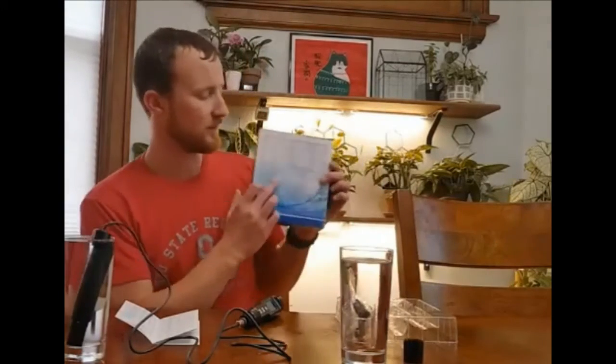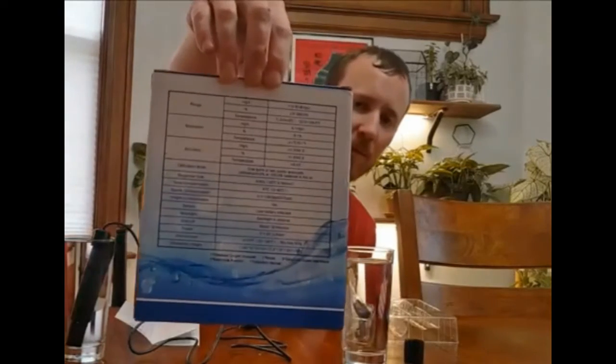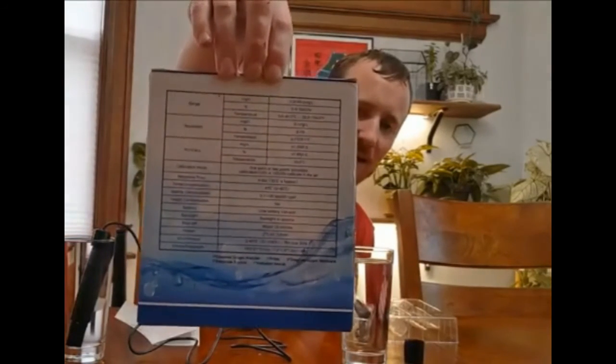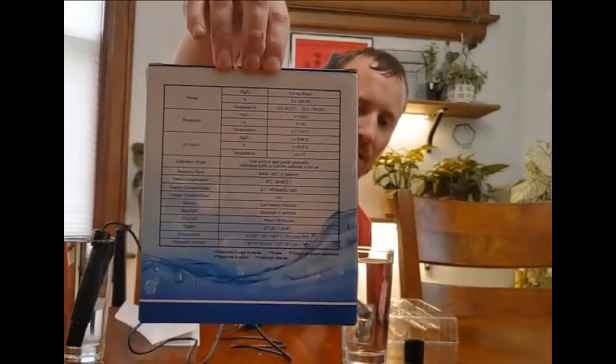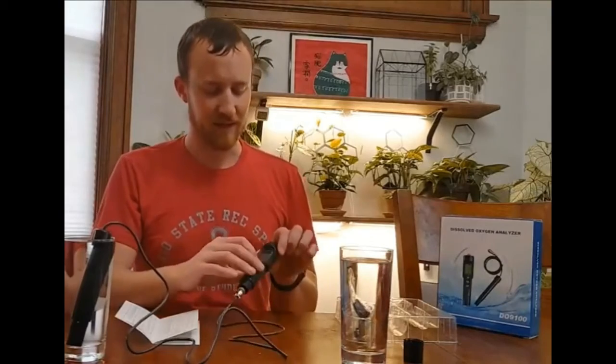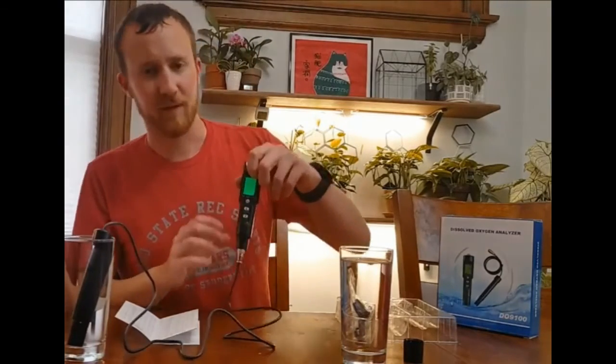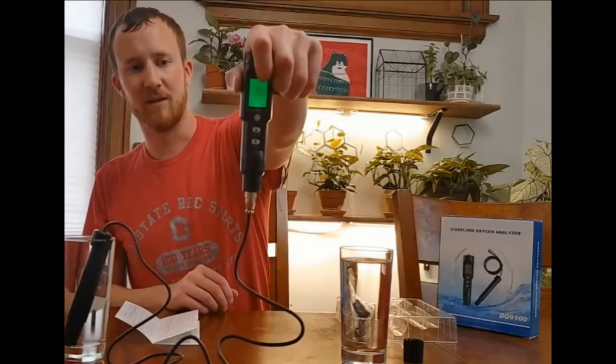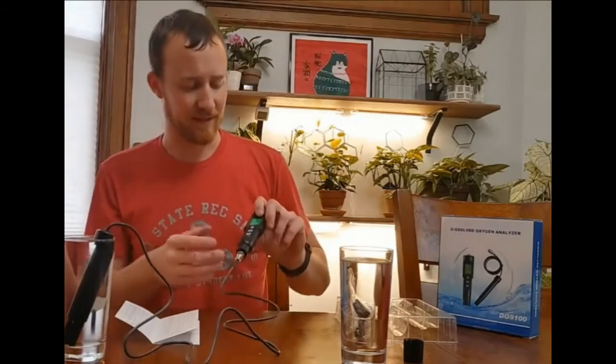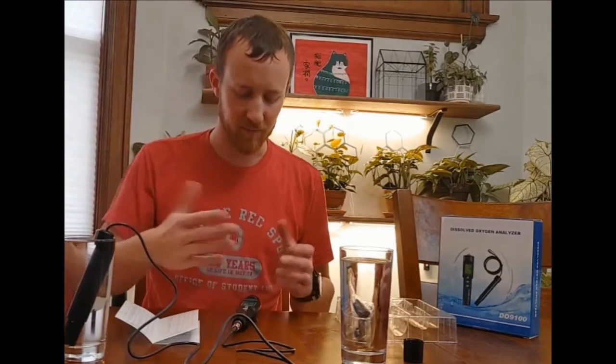It's clearly labeled and everything. It's got all the parameters on the back here. I'm going to put that in so you can see that a little bit more in case you need any of that information when you're buying it. Overall, I think it's a pretty nice device. It is backlit too. So if you need to read it in the dark or something like that, or the light's not great, you can do that as well.